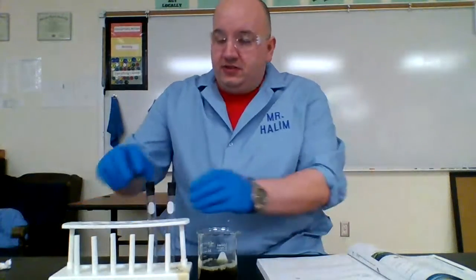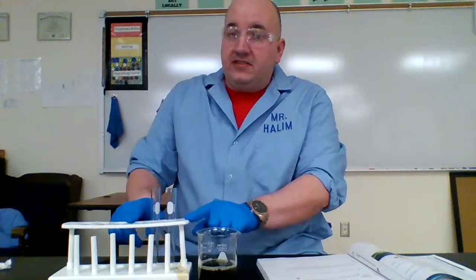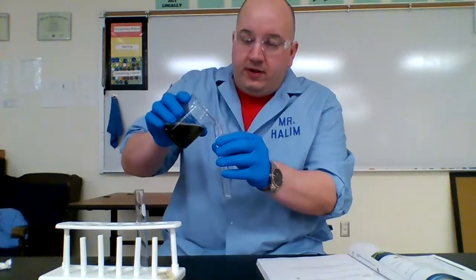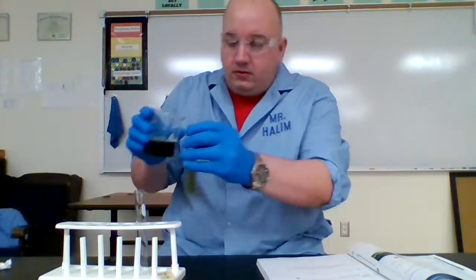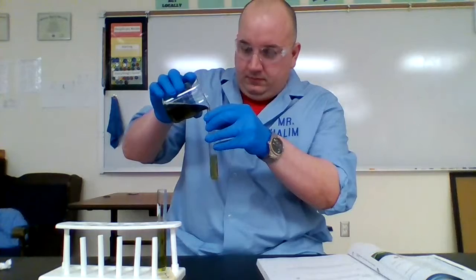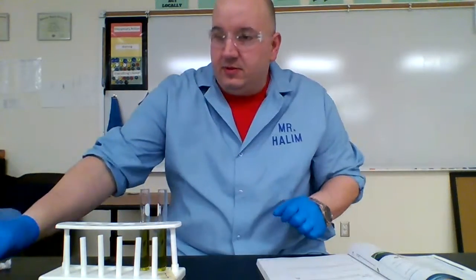All right, so now you got your 2 test tubes. Make sure you remove the caps from them. Now you're not going to be able to have the stand at your table, so you're going to need to be extremely careful holding these test tubes. So now as you take them, pour it about halfway, fill them up about halfway. And I can see each of them is about halfway.